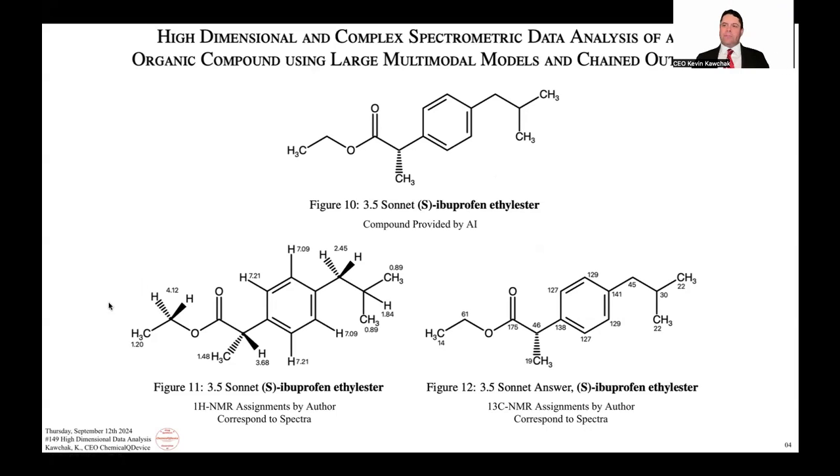So with the protons left to right, it's methyl 1.2, diastereotopic protons at 4.12. And again, these show up at just slightly different ppm, and it's due to this electronegative withdrawing group here. Also this methyl at 1.48, hydrogen at 3.68. These are all making sense across the 1D NMRs, and then also with the 2D NMR spectra as well.